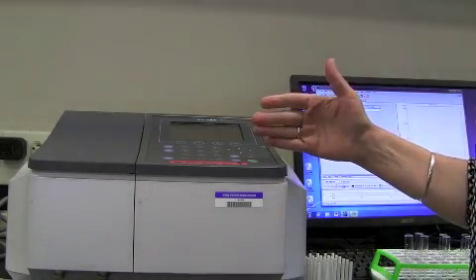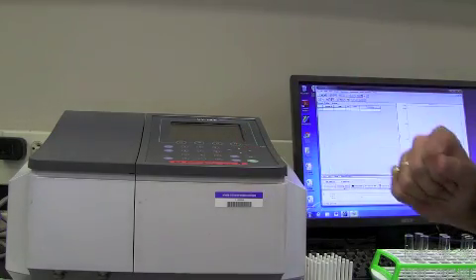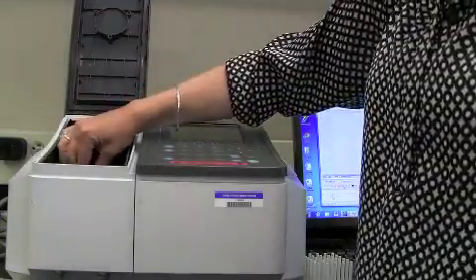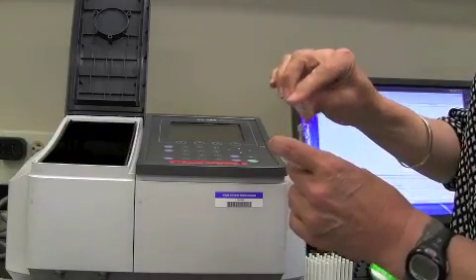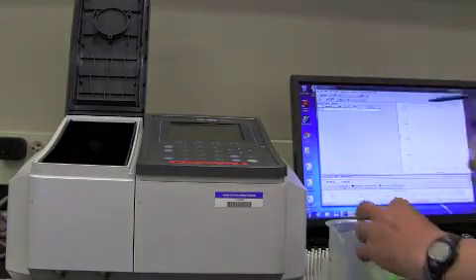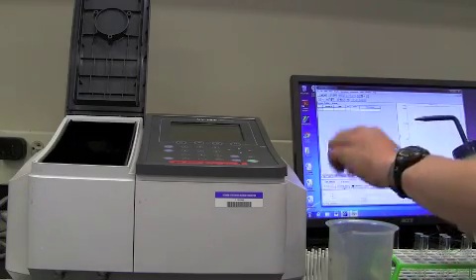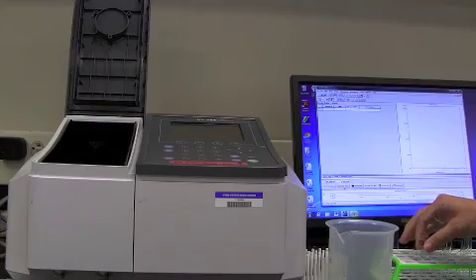What that then does is it's telling the machine what 0 absorbance should look like, because there's no cholesterol in this sample, we shouldn't be getting any absorbance. Once we've zeroed the instrument, we take out the front cuvette, pour its contents back into the 0 tube. We can then rinse out the cuvette. We do have some water bottles, so you can just rinse the cuvette very briefly. And now you're going to start adding your standards and unknowns and reading their absorbance.